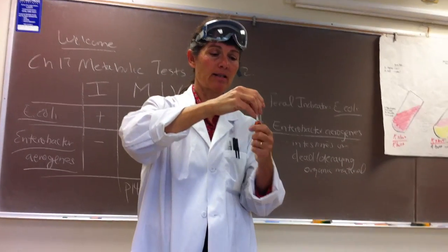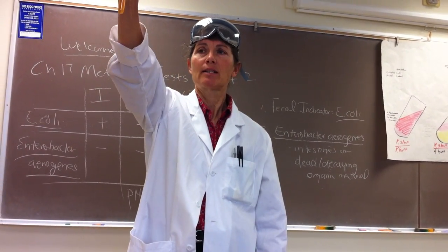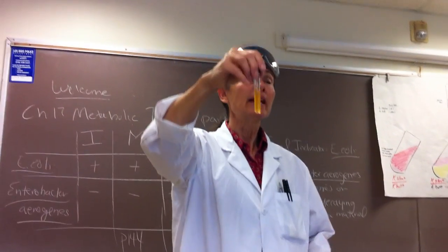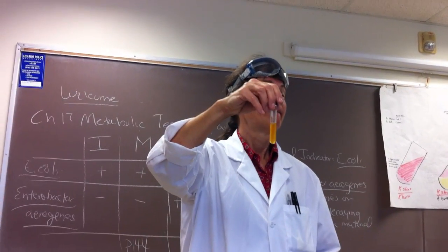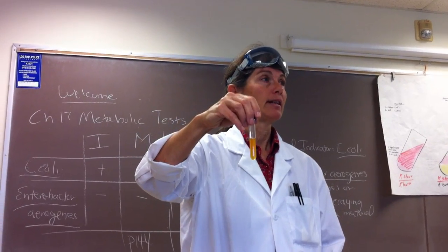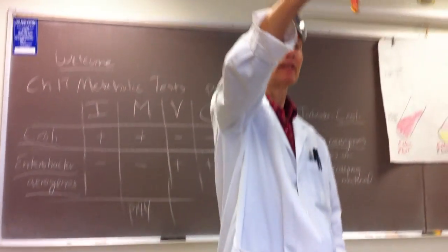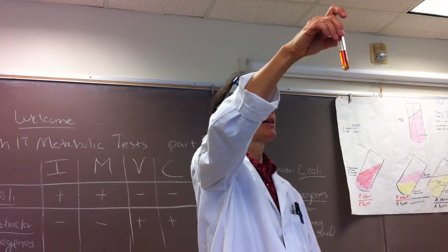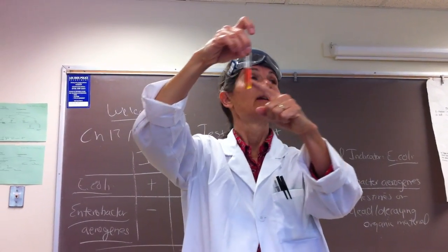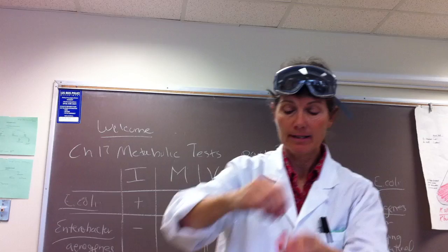Okay, so help me out, you guys. Is this a positive or a negative test? It's negative. It's actually negative. Okay. So, what does a negative test tell us? It lacks the enzymes to carry out mixed acid fermentation. Dynamite, you guys. So this would be a negative test. What about this one? That's positive. That's a positive test, okay? So what does this tell you about your organism? Right, it has the enzymes to carry out mixed acid fermentation. Dynamite, you guys. Excellent, okay?